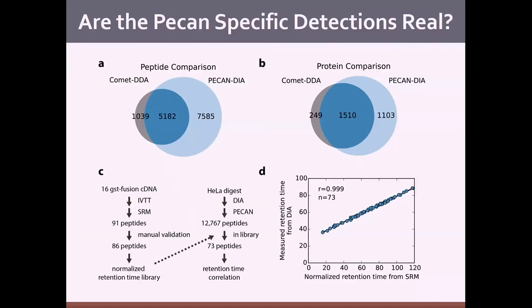And I won't go into too much detail, but we also spent a lot of time working with Bill and Lucas to evaluate whether or not the P values and Q values coming out of Percolator from the Pecan data were actually real. Just because someone reports a P value or Q value doesn't mean that they're actually real Q values. But we did do a lot of the basic sanity checks that the Q values were making sense. That was another thing that was important to us.